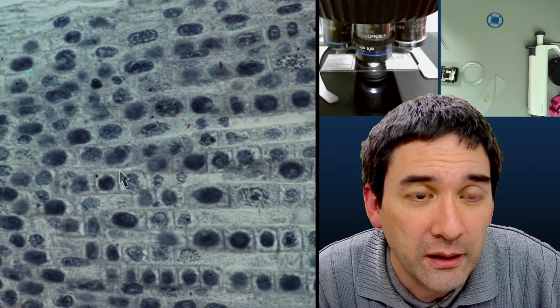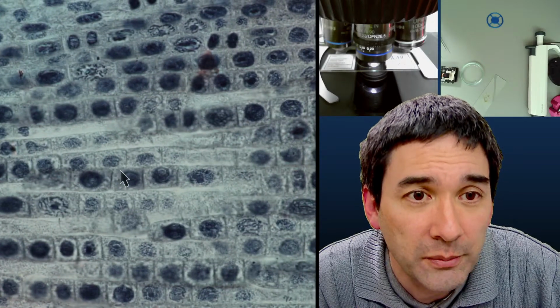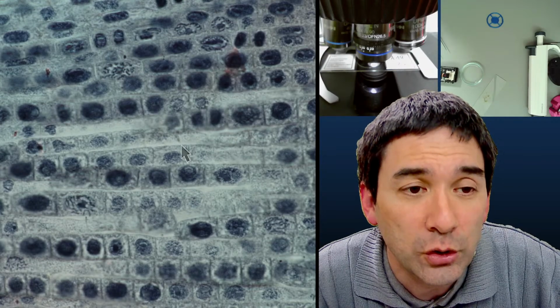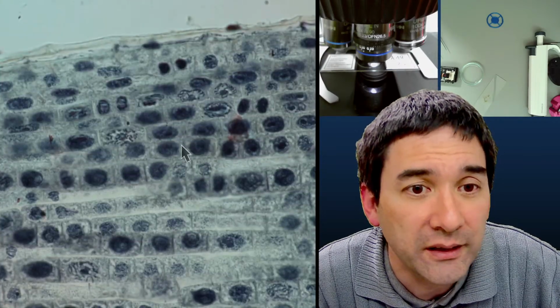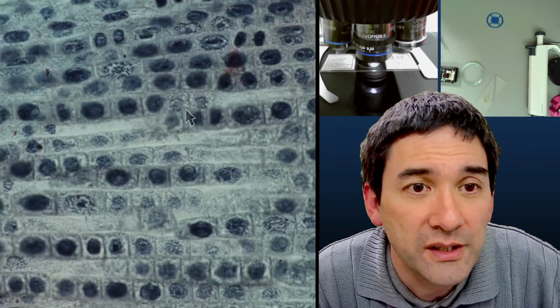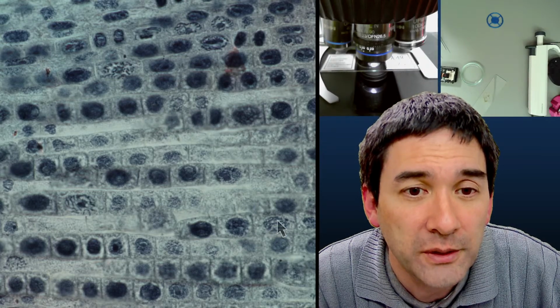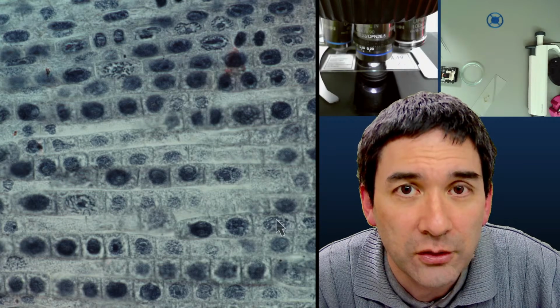That's, by the way, as I mentioned with my students, what I do: they have to look at this, count the cells, and determine how many percent of the cells are actually dividing. This one over here, you also see some chromosomes here and here. This one is in prophase. Those little lines are chromosomes.